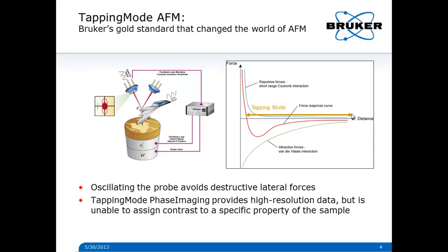The AFM tip oscillates back and forth on this curve, interacting with the sample, but forces are convoluted with the transfer function of the cantilever, filtering out frequencies away from the resonance and reporting only an average response of many interactions through the lock-in amplifier. While this is in no way detrimental to basic imaging, it restricts the information beyond sample topography that can be gained and unambiguously assigned to a certain sample property. This is unlike the previously shown force curve, during which one has direct control and is able to extract useful sample information.